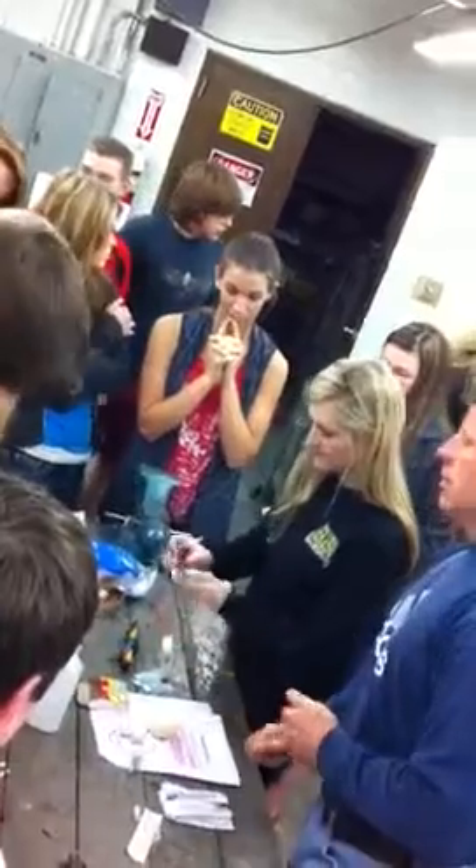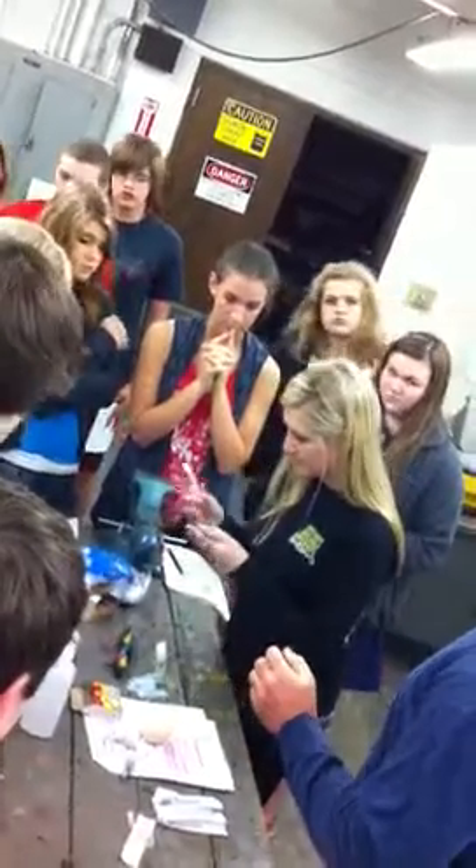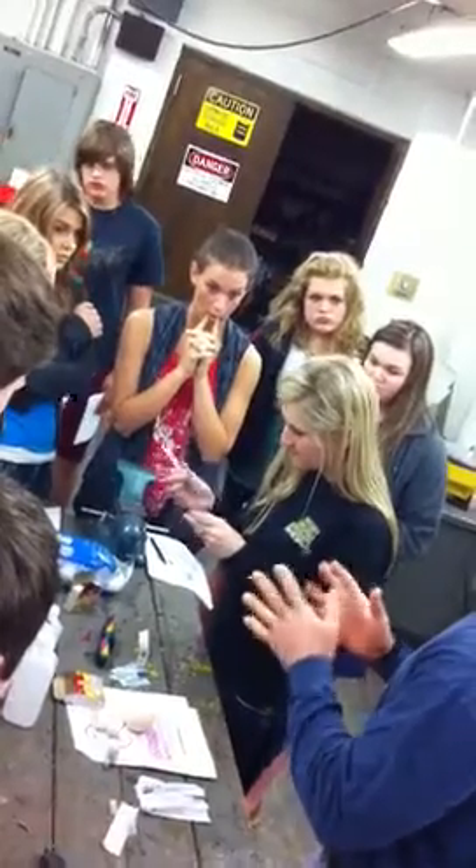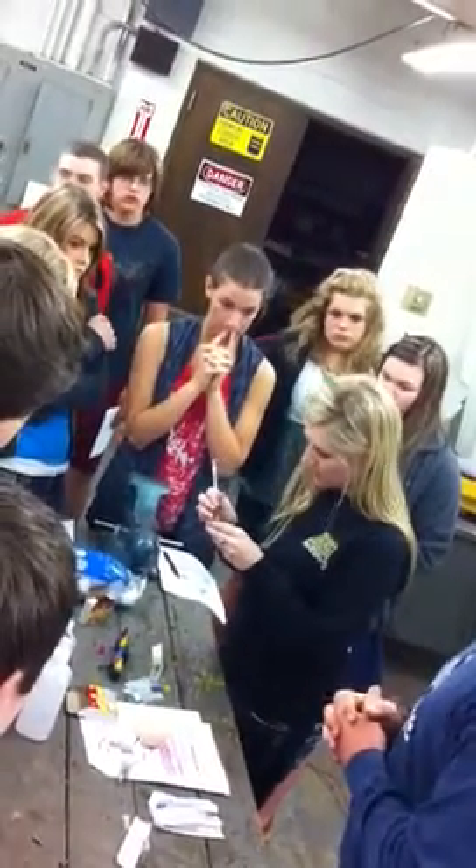Y'all keep these needles clean. When you're not using it, put it back in the case. Keep it sterile. If that needle gets dirty or you drop it, don't use it — because we don't want to puncture and get bacteria or anything inside that egg.